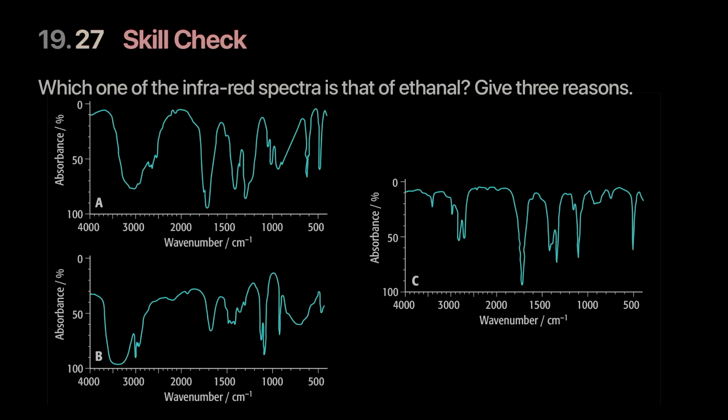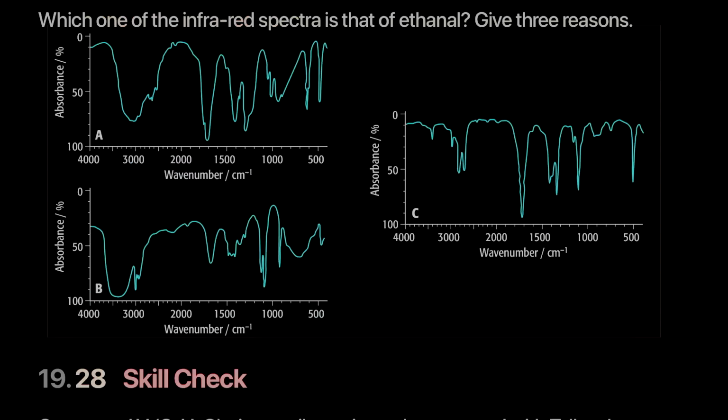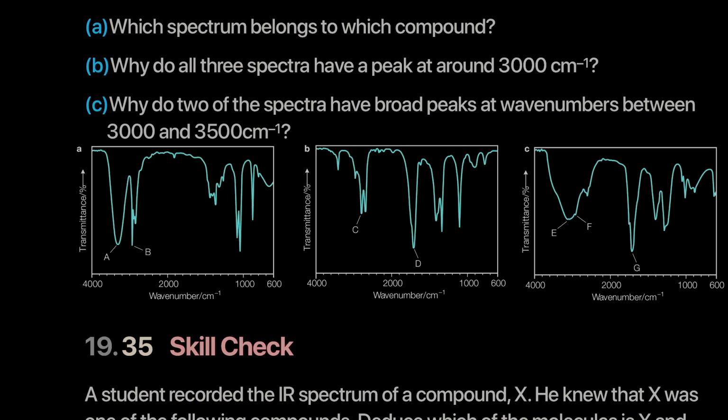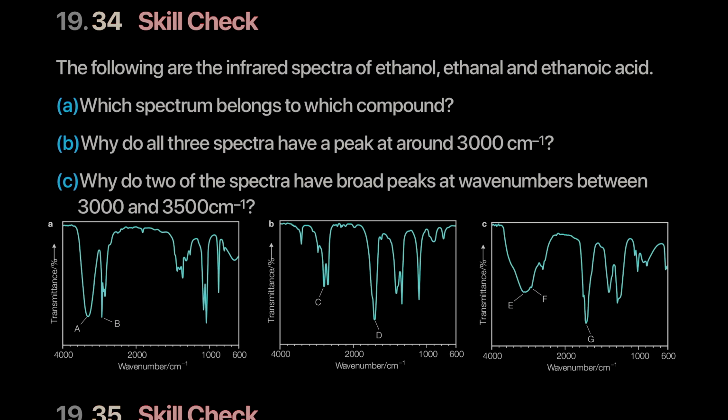And looking at 27, you can figure out that this looks like the acid, very deep. This is also wide, but it seems to be two separate ones. We'll look at more detail a little later, but you guys start getting the idea. Let me show you one more example if I can find an acid here. Yeah, right there. So look at this example. Of all the three graphs, just from what we have studied, you'll realize that this fellow right here has the widest, broadest peak. So this looks like it must be an acid.